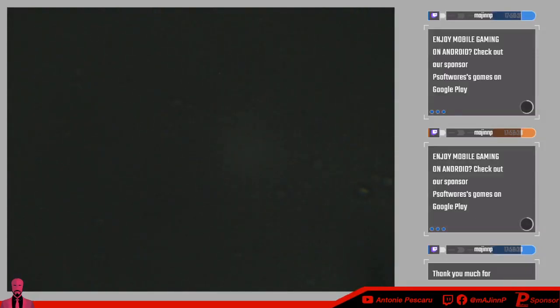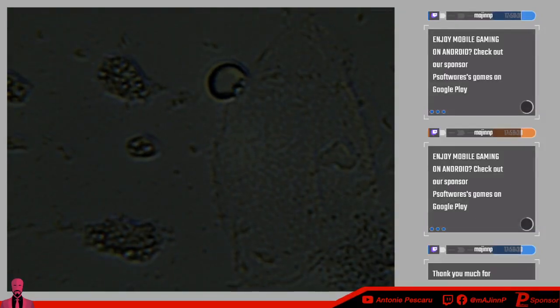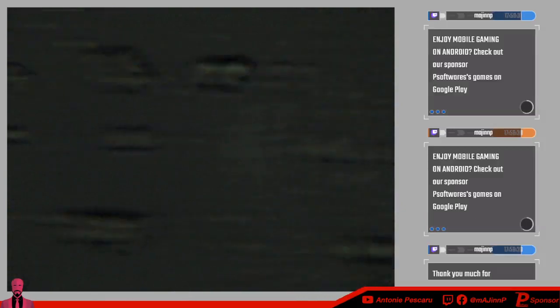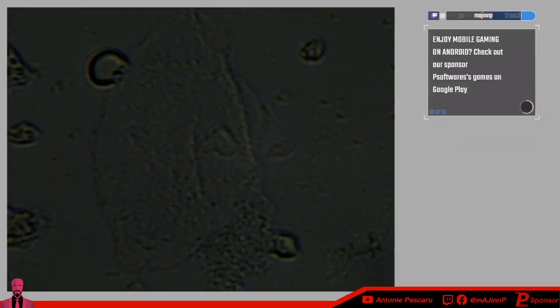You just have to look around. Oh, is this one? Is this one? Oh, yeah, perfect. I think I got one, even though it's super dark. I probably still think that it's... I don't think it's a buccal cell, because the nucleus looks too messed up.